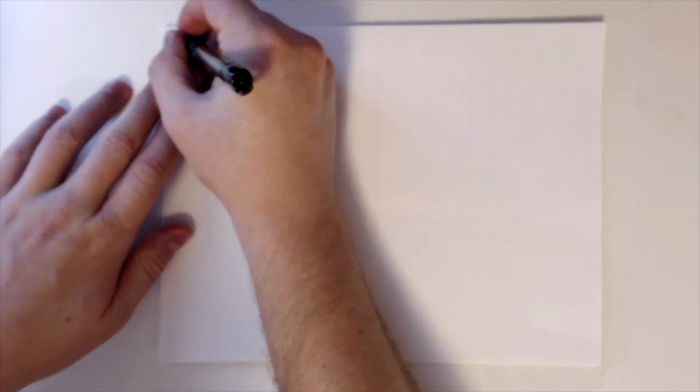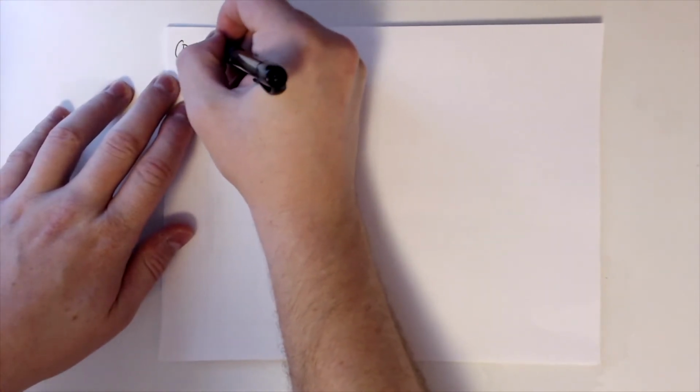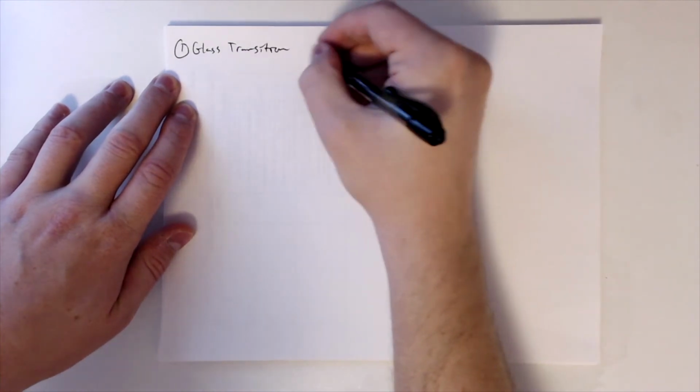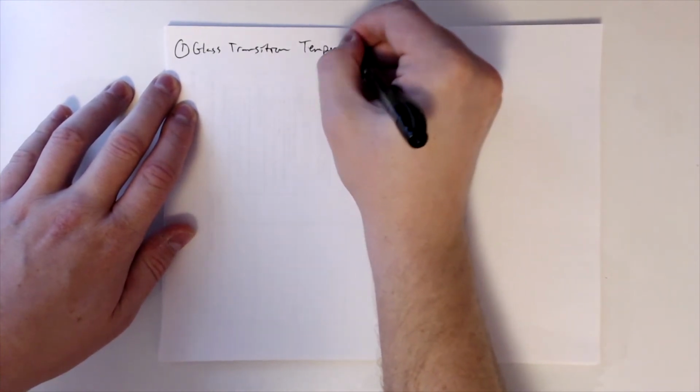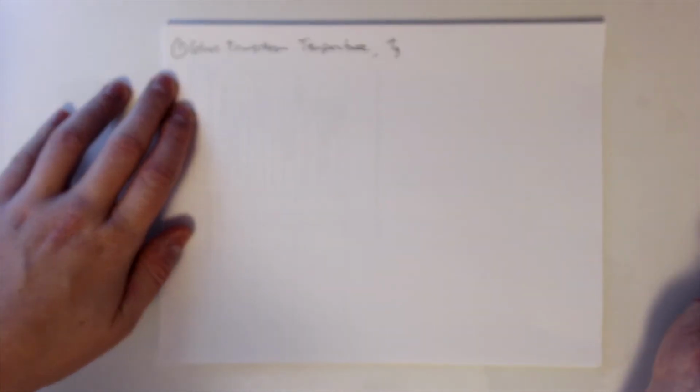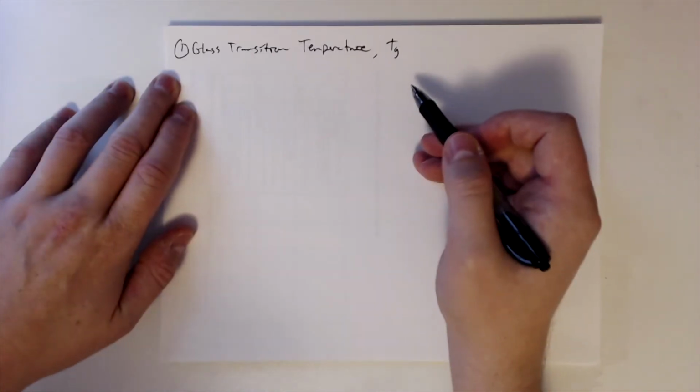Okay, so now let's go through transition by transition and take a closer look at each of these. Let's start with the glass transition. Again, you're probably familiar with this being called Tg.